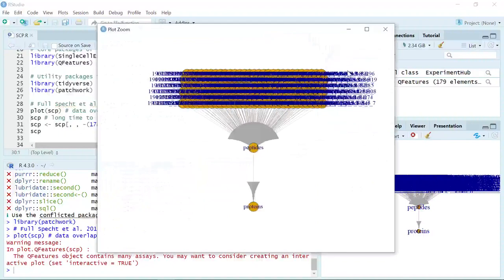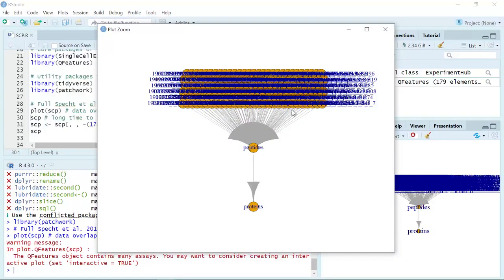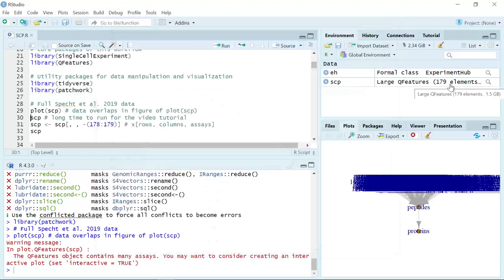From the data window we already know there are 179 single-cell experiment data in this data set. Because we have so many single-cell experiments inside the data set, it is very hard to see the individual data sets. For the full data set, they aggregate the PSM data into peptide, then aggregate the peptide data into protein data. So we have 179 single-cell experiment data here.